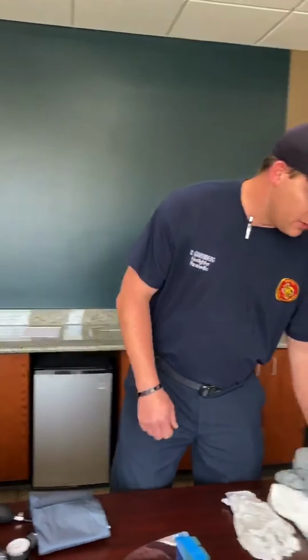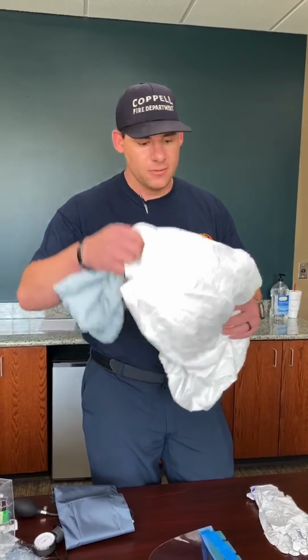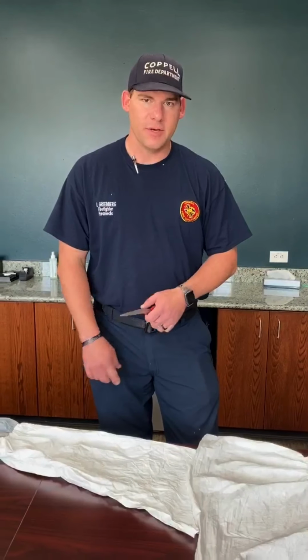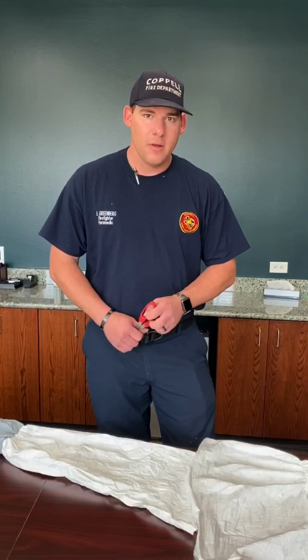Right now we have a limited supply of gowns on the ambulance, so we're going to have to modify Tyvek suits. So we'll have 5 gowns or 5 Tyvek suits, either one. And we're going to show you how to modify the Tyvek suits. I'm going to show y'all how we cut the Tyvek suits to make the gown. Anytime you use the gown, it should only be for any aerosol generating procedures: nebulizer, non-rebreather, CPAP, BiPAP, intubation, CPR using a BVM.